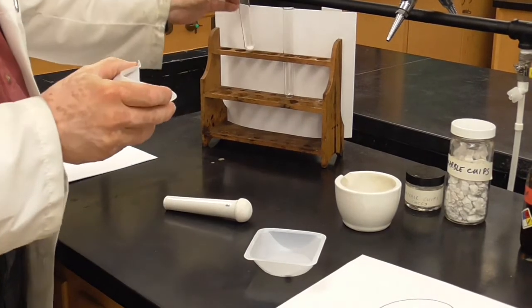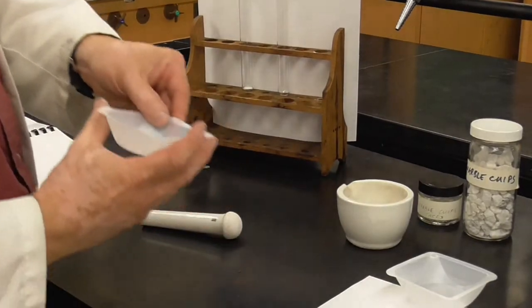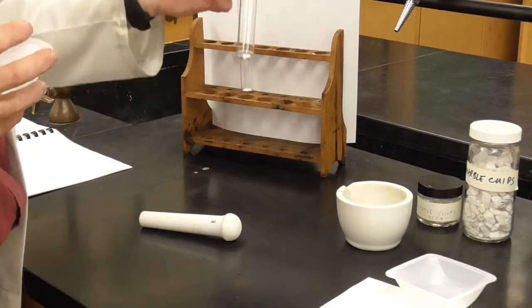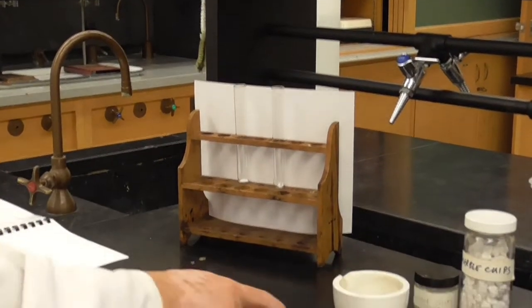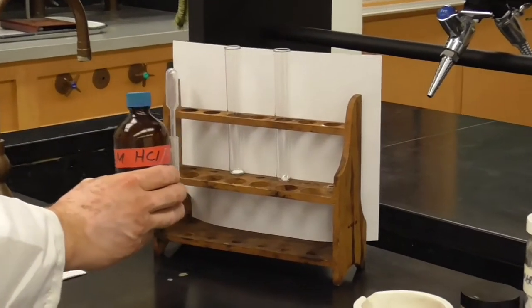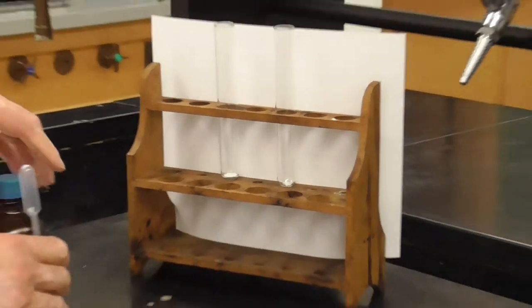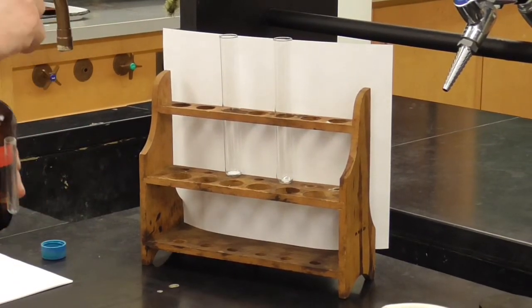There's the ground up powdered one. And here's the one where we've just left it as a chunk. Okay, so surface area, here's our 6 molar hydrochloric acid. We'll go ahead and add about 2 milliliters. Maybe I'll do 2 squirts. Each squirt's about a milliliter to each test tube.